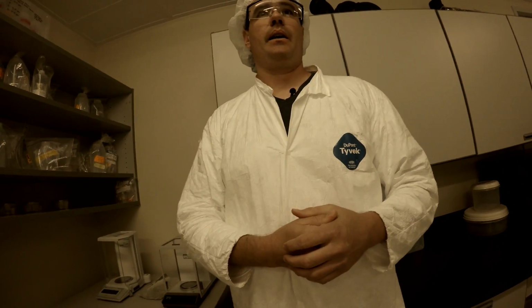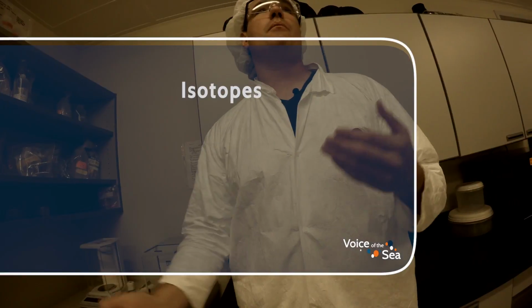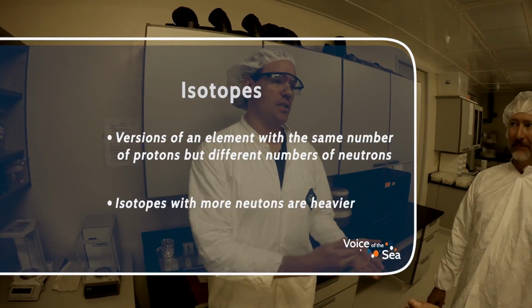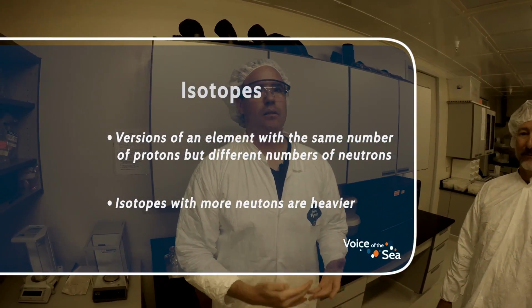And that is the best way to get at the concentration of radium in natural samples, by what's called isotope dilution. You take isotopes that are enriched, mix them with natural samples, measure the isotopic ratios very, very precisely, and get a very precise determination of the concentration. It's the best way to do elemental concentration analyses in geological materials.